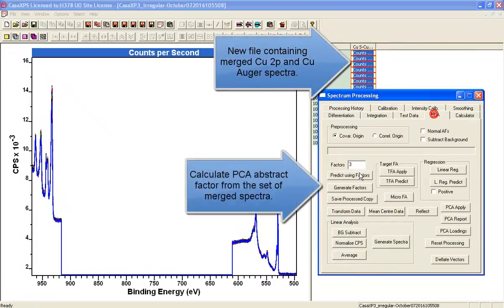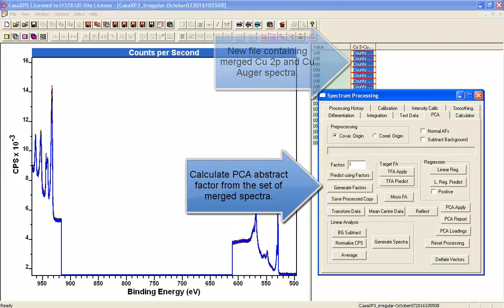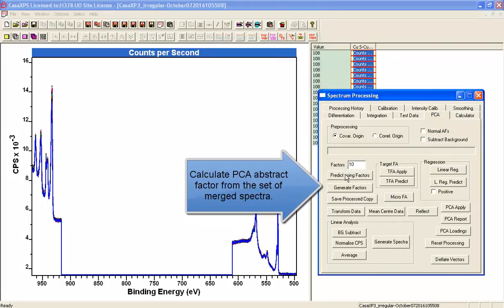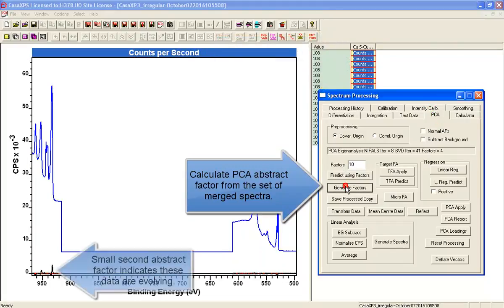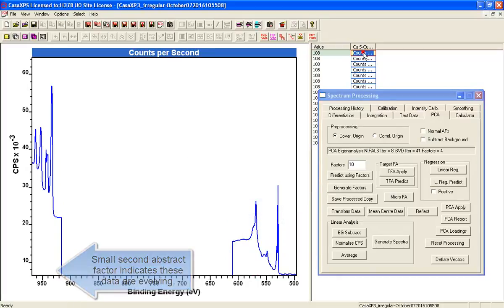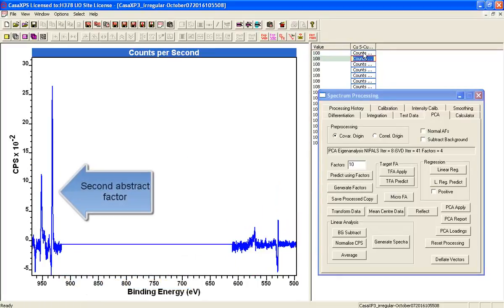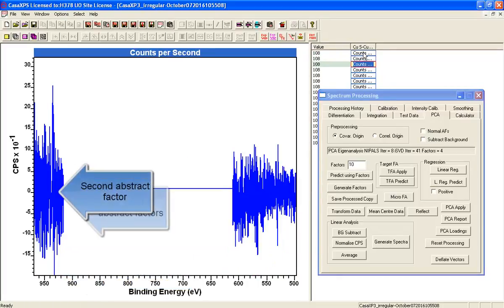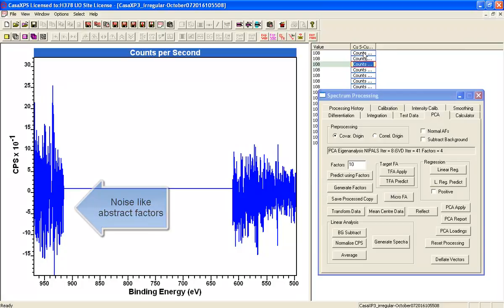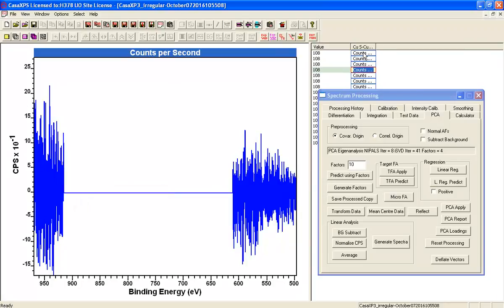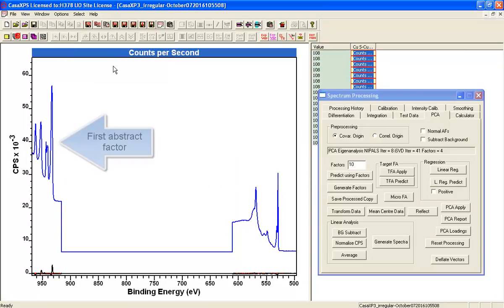And these two sets of measurements that were copied into a separate file are now combined into an irregular set of spectra. And we can look at these using PCA to work out how many different shapes we ought to see here.